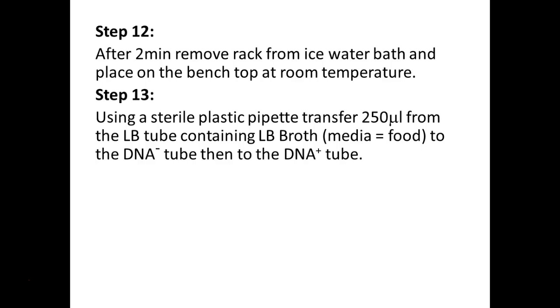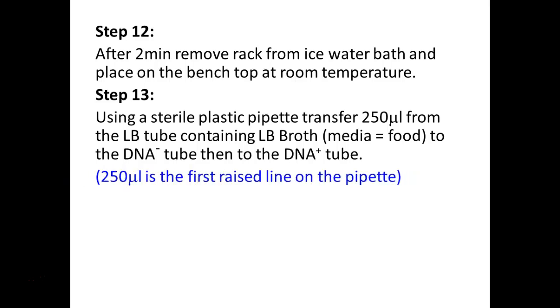You're going to take 250 microliters, and I'm going to give you the large pipetter and the large tips to do that. And you're going to transfer 250 microliters of this food from the tube I'm giving you into each one of your tubes. And as long as you don't touch down into the tube, right, you squirt from the top of the tube, you don't have to change your tips. But also maybe do your negative tube first, just in case, right? And then do your positive tube. So you don't contaminate positive and negative, right?